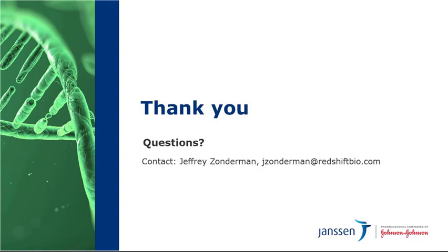Our next question, has RedShiftBio done any work comparing the precision and accuracy of the AQS3 Pro to a CD spectra device? Yeah, Eugene here. Yes, the answer to that question is we have. In fact, as part of our work with Elion, which I presented in one of my slides, they also looked at performance of CD. So if you go to our website, you should be able to find some information on that as well.